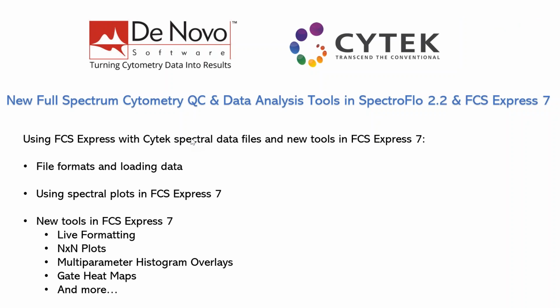So again, what we're going to be looking at in this portion of the webinar is using FCS Express 7 with Cytek spectral data files and some of the new tools in FCS Express. And we're going to be doing that in the context of the same data sets that Janelle had presented in panel 1 and panel 2, some of the multicolor versus single stain controls, as well as some of the other bead data sets that were shown.